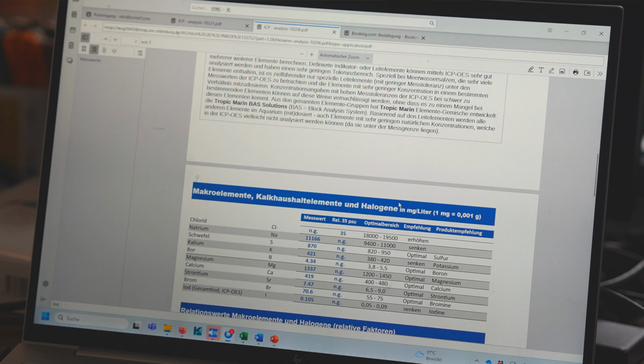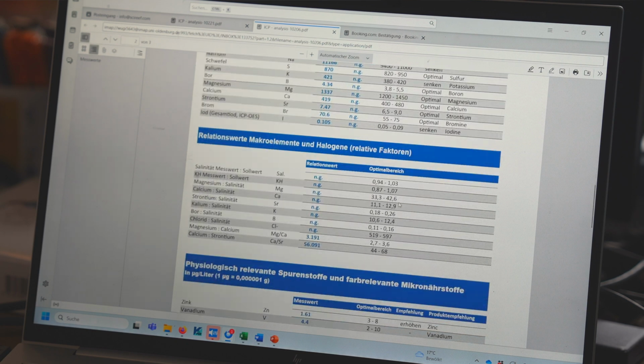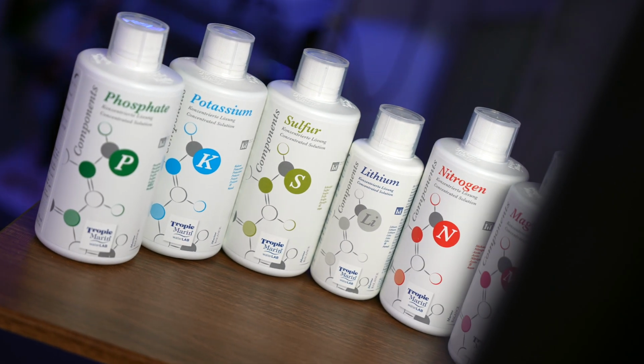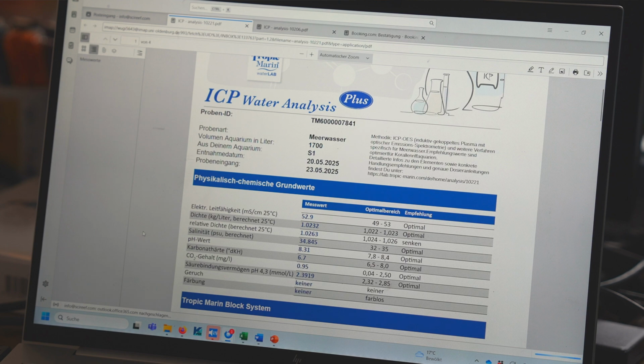So either if it's above the recommended range, then the recommendation would be to try and lower it. If it's below, then the recommendation would be to add certain solutions, dose these elements either with a block system or with the individual element solutions. With that, you get a pretty good overview and idea what's happening in your aquarium and what you should potentially be doing. We'll look at that on the website in a second, because there it's more detailed, there's more descriptions, what can happen. But now we quickly have a look at the ICP Plus.